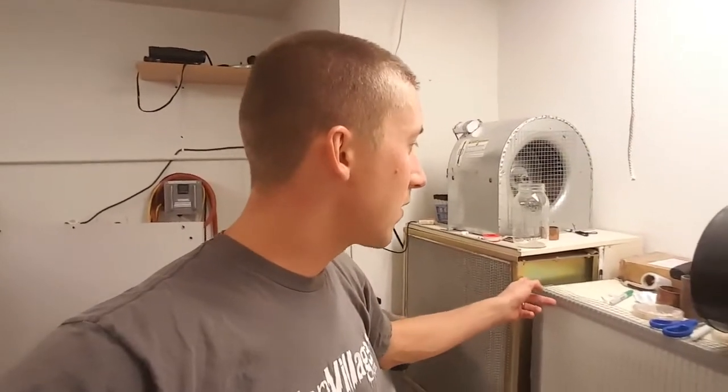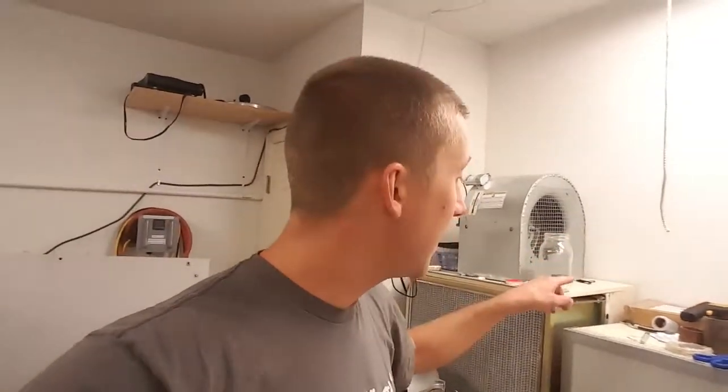This HEPA filter is over a year old. I've already changed the pre-filter once, and when I changed it the first time it was pretty dirty. I'd much rather clog up a $15 or $20 pre-filter than the HEPA, which is about $150 — and this one was about $130.